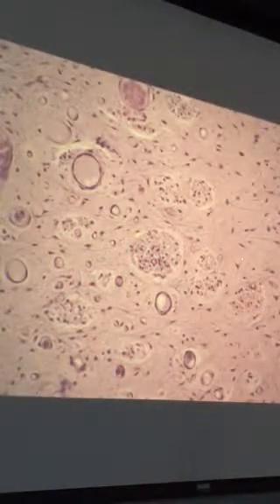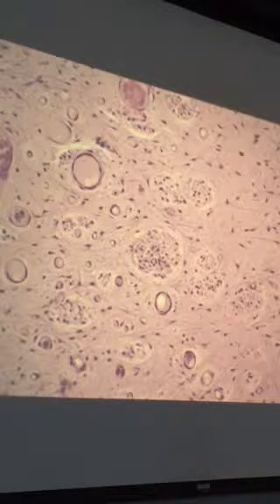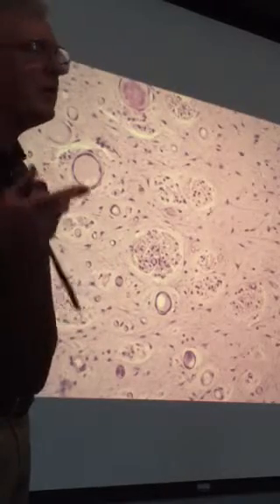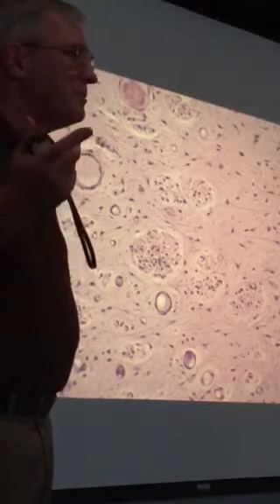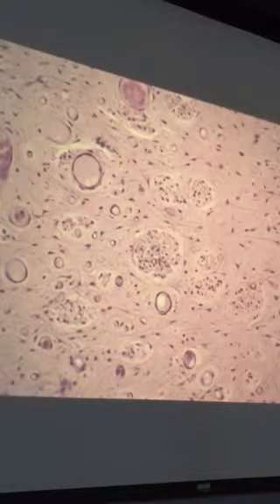Okay, well, same thing here. And what are all these fibers that we see around here between the cells? Collagen type 1 or collagen type 3? Okay, mostly collagen type 1. Okay, well, we've got a little predentin right there, we've got odontoblasts, cell-free zone, this is all stuff we've seen on the previous slides.